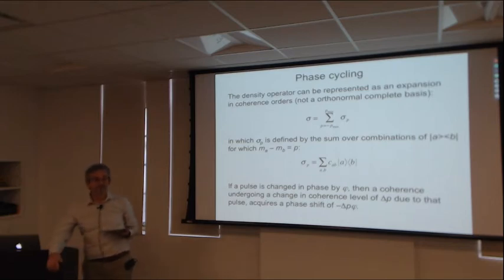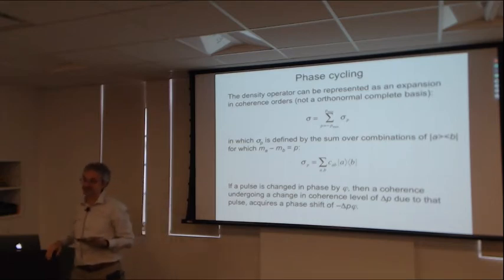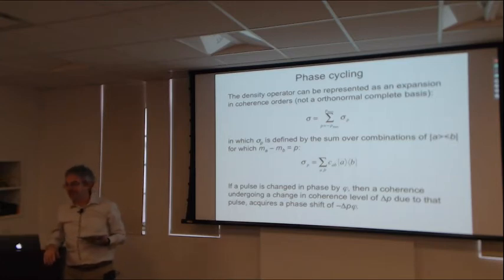However, once you put the isotopes in, phase cycling becomes very simple because you're mostly selecting for transfers from 0 to plus or minus 1 on the proton channel and, independently, plus or minus 1 or 0 on the nitrogen or carbon channel.